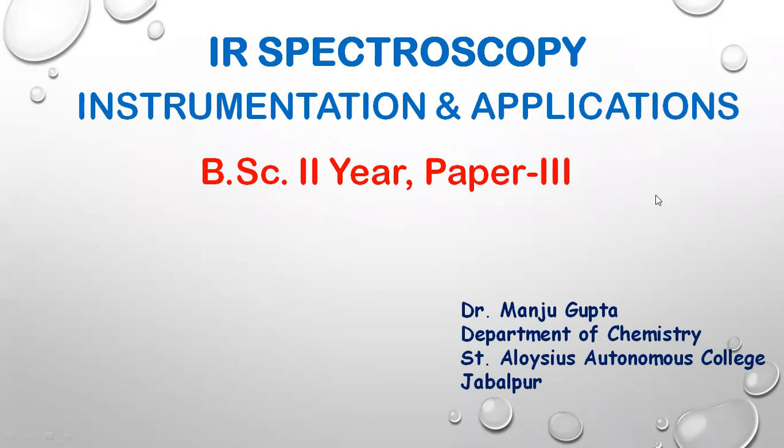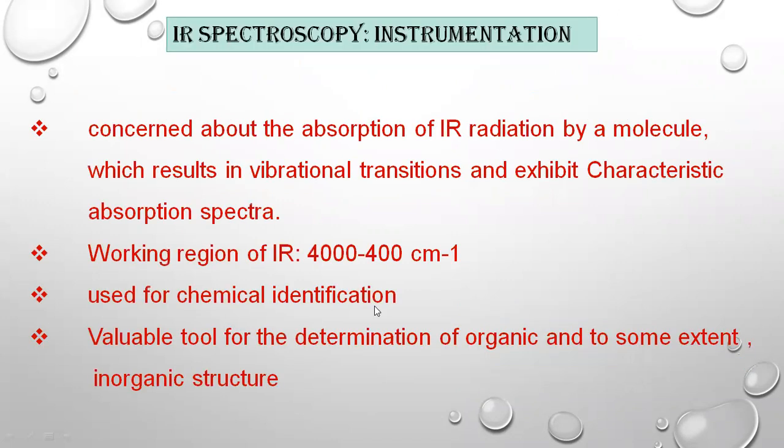Hello students, today I am going to explain the last topic of first unit: IR spectroscopy, instrumentation and application. First we discuss instrumentation.